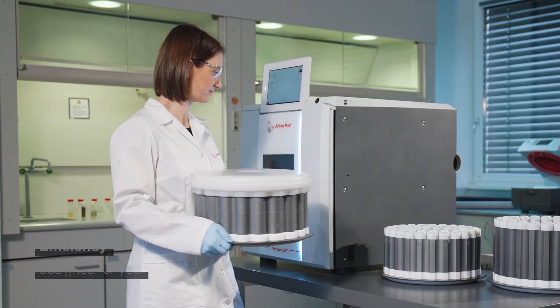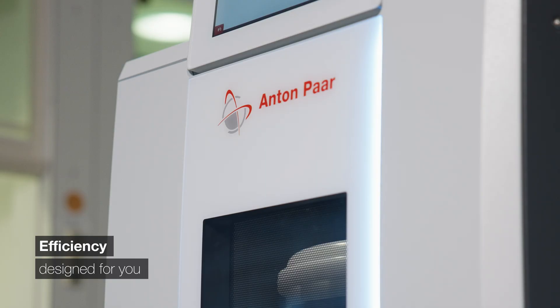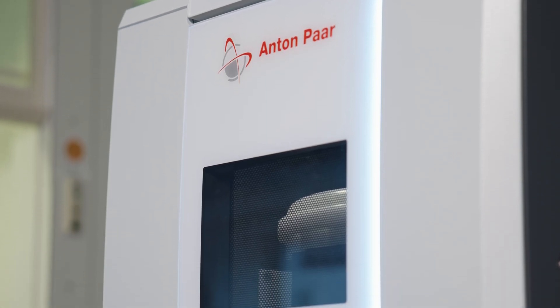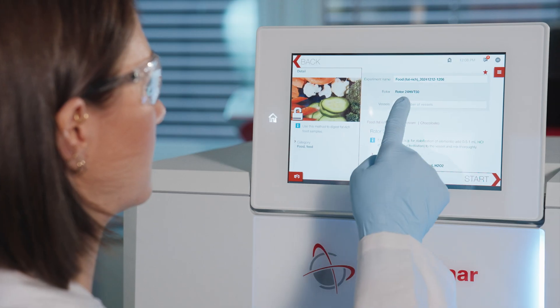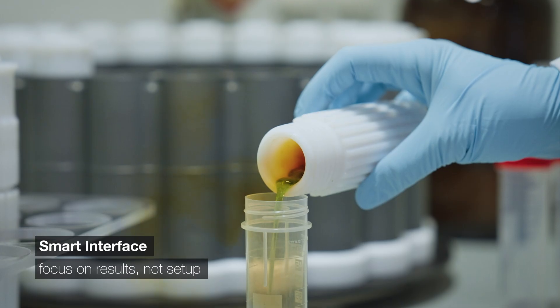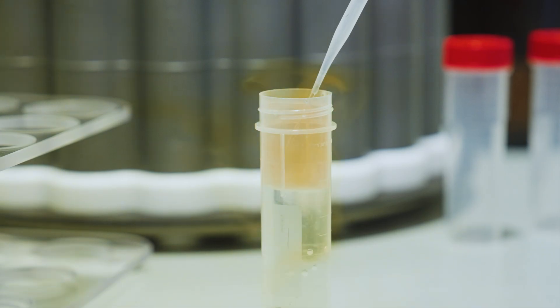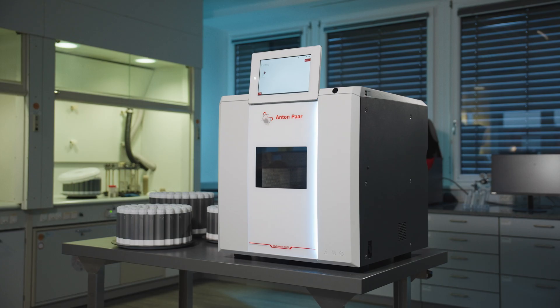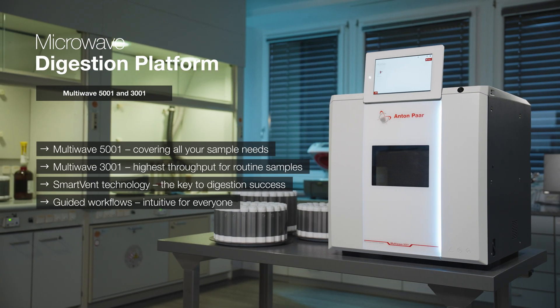There's a hands-free door opener, and rotors can be loaded directly inside the oven. Safety is ensured by design and certified independently. Built for the modern lab, the instrument's interface makes operation seamless, allowing scientists to focus on results, not setup. Sample preparation perfection with the new MultiWave 5001 and the MultiWave 3001 by Anton Paar.